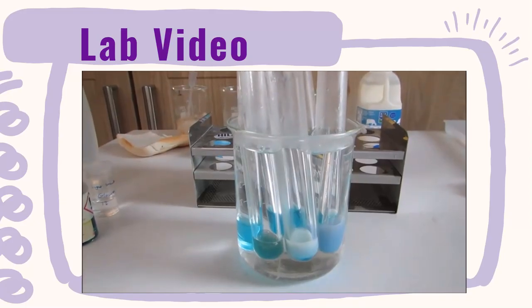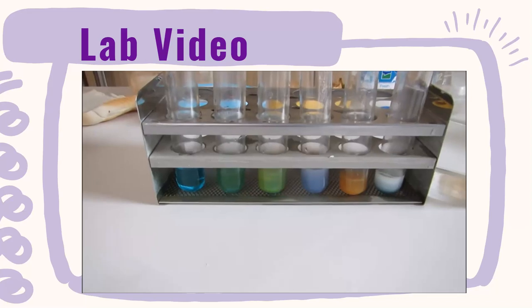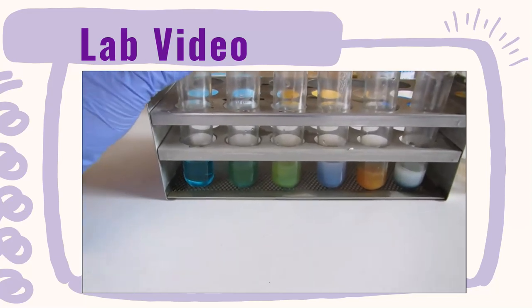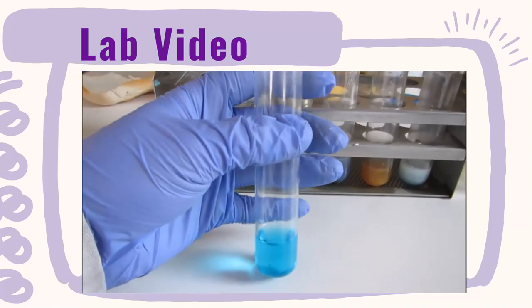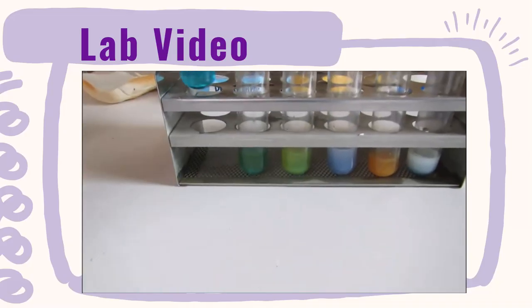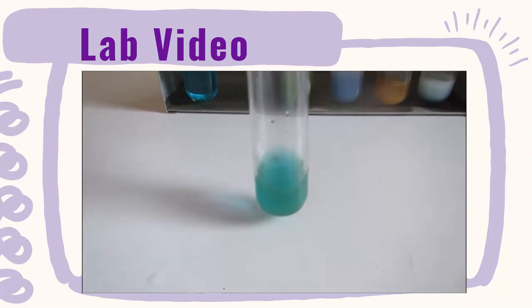So I have numbered all the tubes, and I'm just going to set them all in. Make sure you have labeled them beforehand so you can identify which one is which. Then you just need to leave them for around 5 minutes, and then I'll show you what they look like once they come out of the water bath.